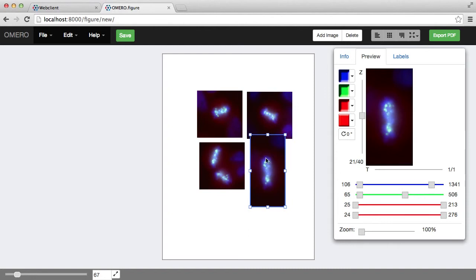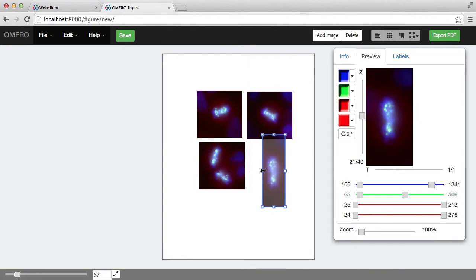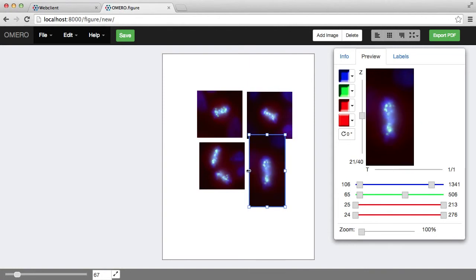But the panel itself, the pixels will not be squashed. It will just be resized within the image.